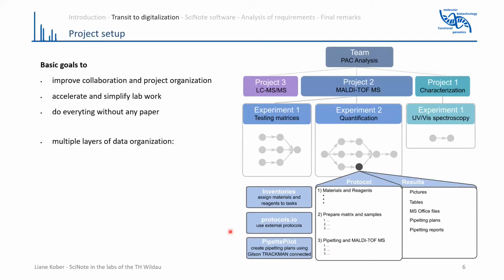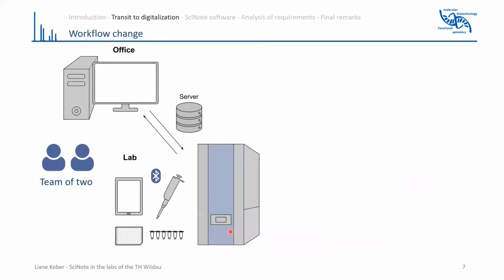There's also the Gilson integration here. So that way our workflow was much more simplified. SciNote is also a web-based ELN. So we planned the whole experiment again in the office.